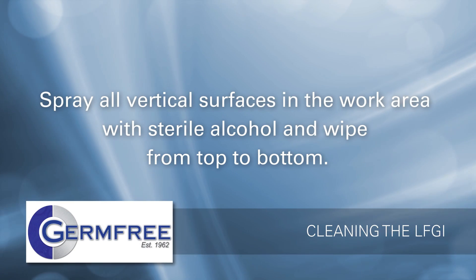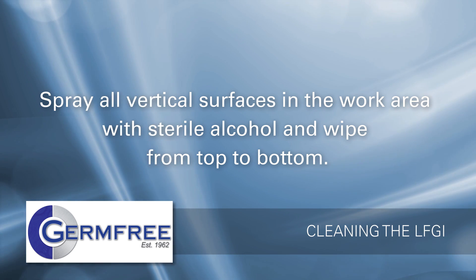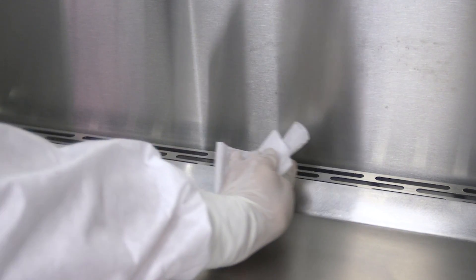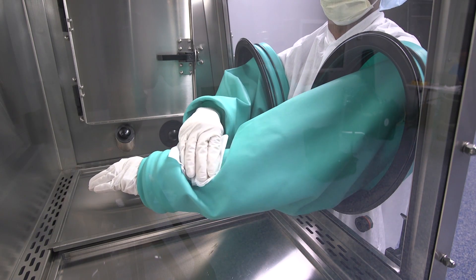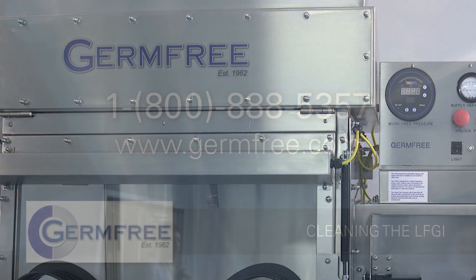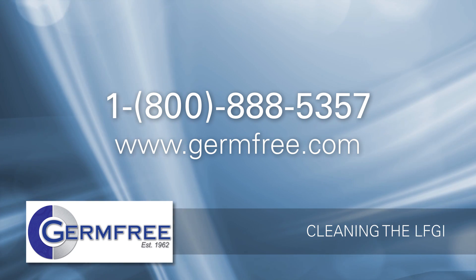Spray all vertical surfaces in the work area with sterile alcohol and wipe from top to bottom with clean wipes, using overlapping strokes moving left to right. Spray the air grills and work surface with sterile alcohol and wipe from left to right with overlapping strokes moving back to front. Spray the sleeves and gloves and rub together, then wipe off. Spray the same surfaces lightly and allow to air dry. If all materials are wiped down prior to placement in the airlock, it should remain clean for a number of preparations in a row.